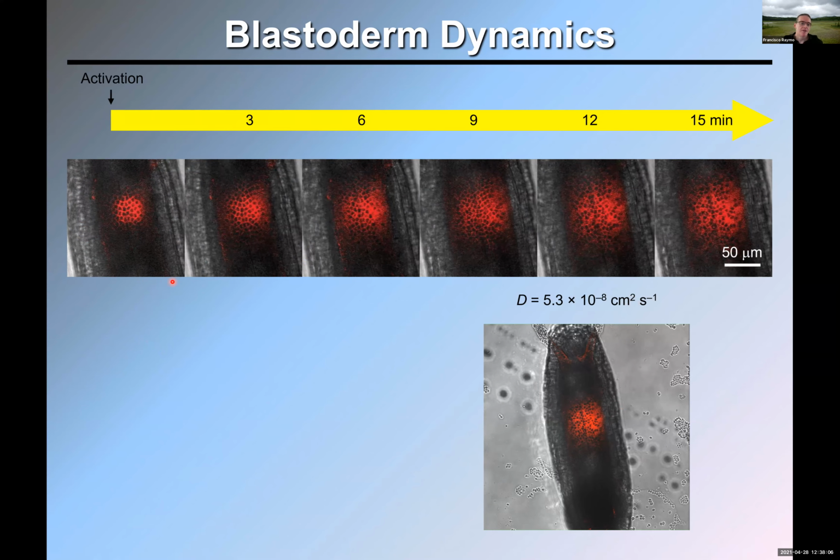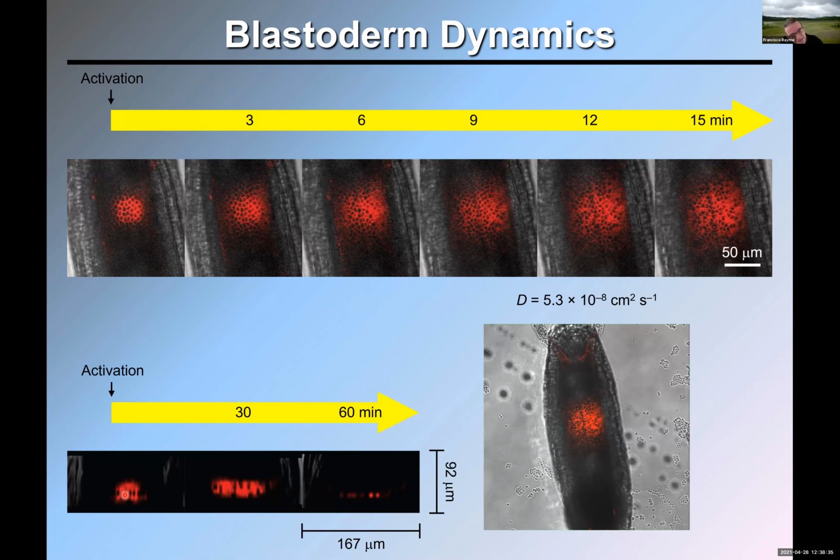And also, you can then, as I described many slides ago, move the focal plane, let's say a little bit up and repeat the process, and then up and repeat the process, and then up and repeat the process. And by comparing these different sections of the sample, you can then establish if there is diffusion in the vertical direction. You can, in other words, reconstruct an image that is at 90 degrees relative to this plane, which is shown here. And then in here, we see that the molecules are not moving vertically. The fluorescence is only moving horizontally.